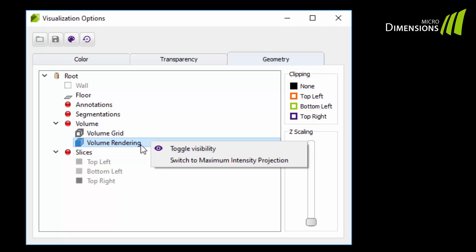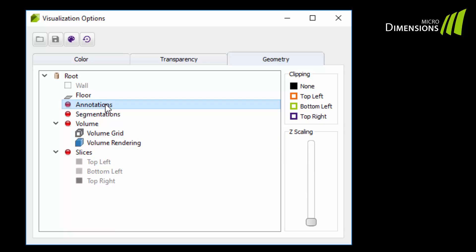The annotation group contains all measurement objects that you have previously defined. Within the segmentation group, you will find all segmentation results. This will be explained in more detail in the segmentation tutorial.